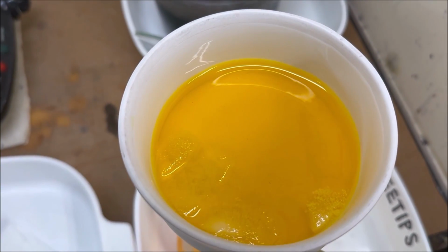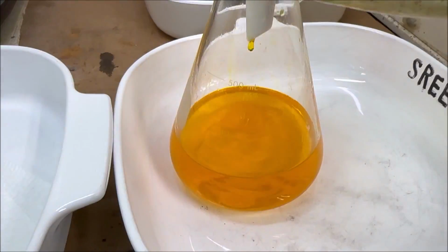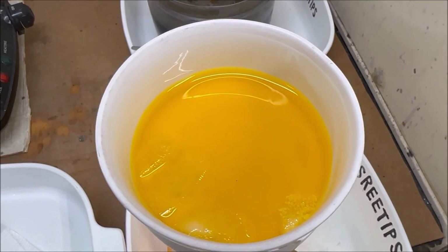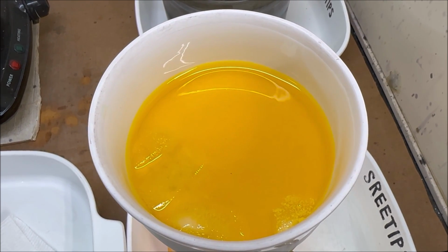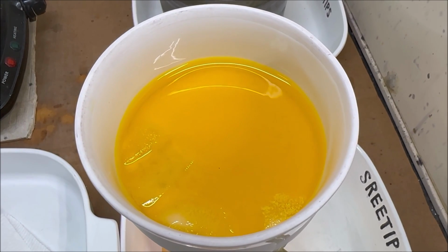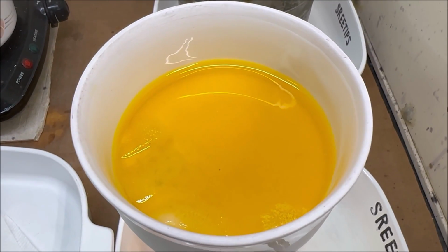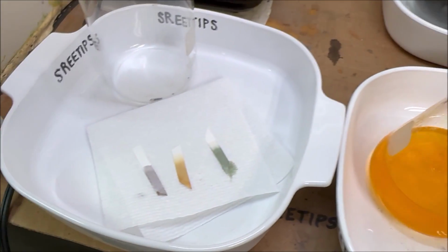Gold is pulling through at a decent rate, and the solution doesn't look too bad, a little cloudy. So this might be either lead chloride or lead nitrate, because we've been using nitric acid and hydrochloric acid in here. So it won't be lead sulfate because we did not add any sulfuric acid.